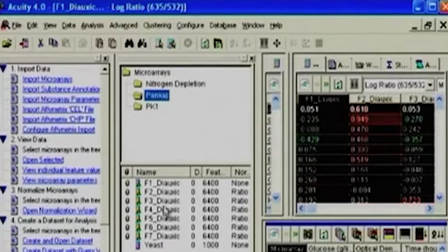So here we see 7 different time points collected, and these are individual slides which one has run with both Cy3 and Cy5. So this is a ratio based image which we are going to see, and we have also got another file which comes from the text to show you that this can also be imported. First you have to individually scan each of the images, make one folder where you group all of this, and then use that whole data set for the combined analysis.